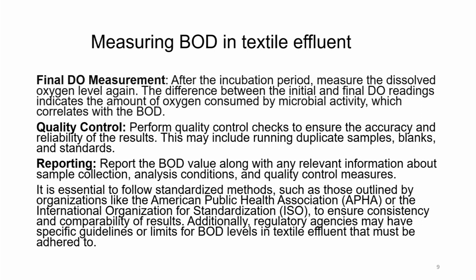Quality control: perform quality control checks to ensure the accuracy and reliability of the test results. This may include running duplicate or triplicate blanks and standards. Reporting: report the BOD value along with any relevant information about the sample collection, analysis conditions and quality control measures.